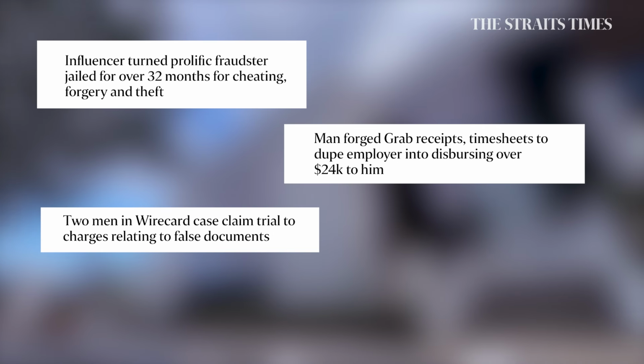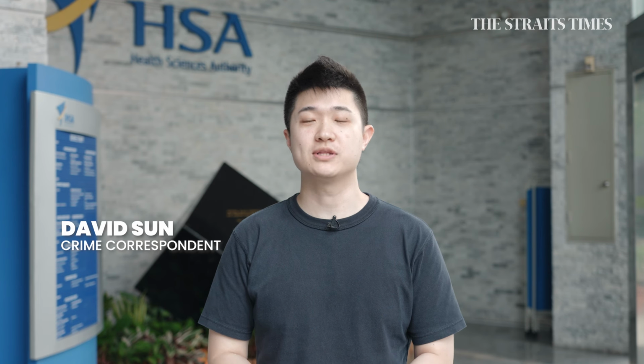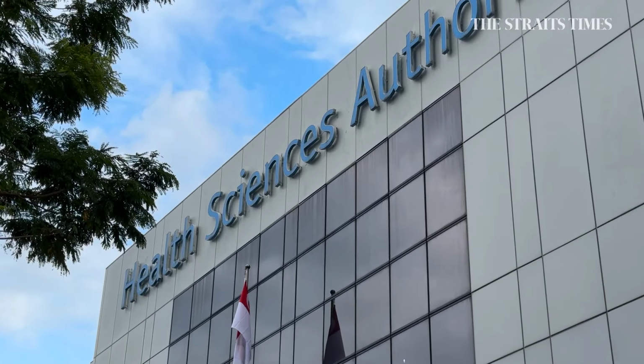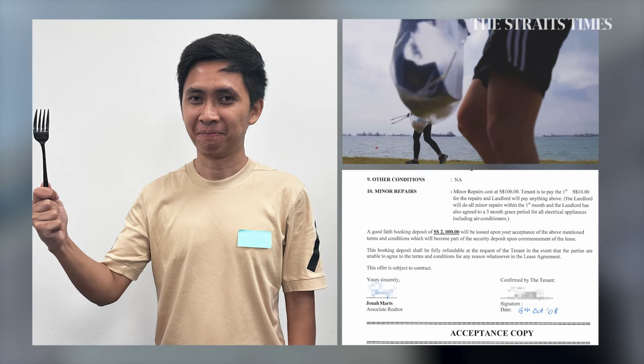There have been many fraud cases making headlines as of late. I'm here at HSA to find out how they spot tampered documents. So today, we're taking 3 things to them to see if they can find out if they have been edited.